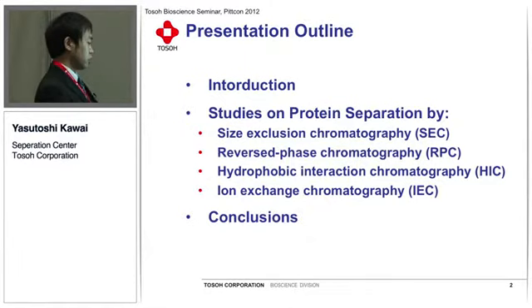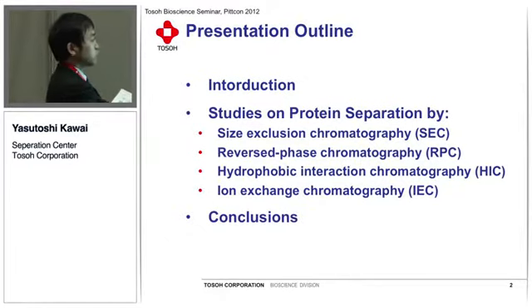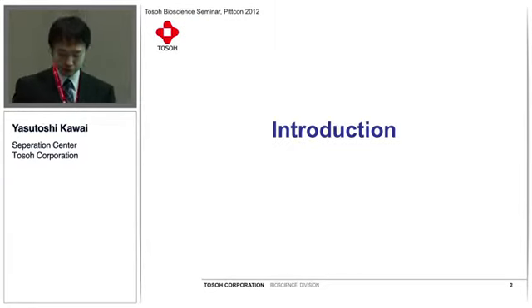This is the outline of my presentation. Mainly, I'd like to talk about the studies on protein separation by the following four chromatographic modes: size exclusion chromatography, reverse phase chromatography, hydrophobic interaction chromatography, and ion exchange chromatography. So next, please.